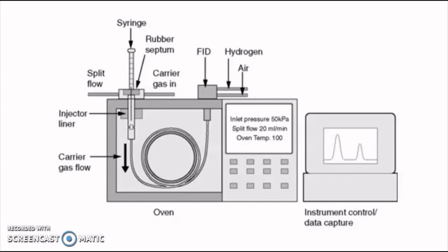The FID detects carbon ions that are produced as the sample molecules eluting off the column burn up in a flame. The concentration of the carbon ions is directly proportional to the signal detected by the FID. Finally, the computer is going to graph this response and integrate the signal, turning our result from the chromatogram into something that we can read.